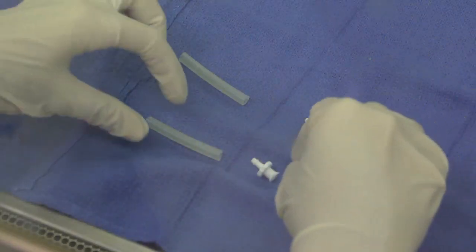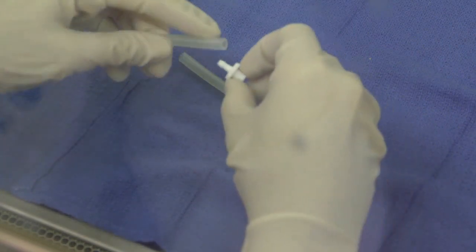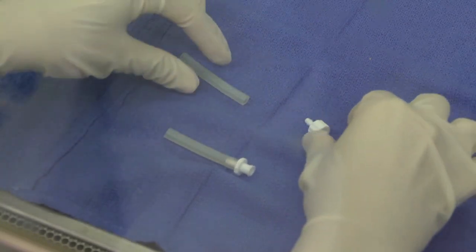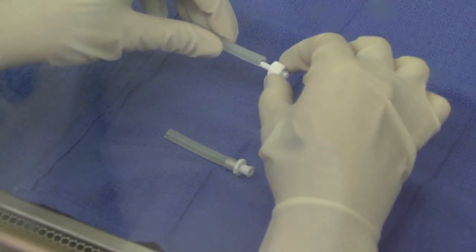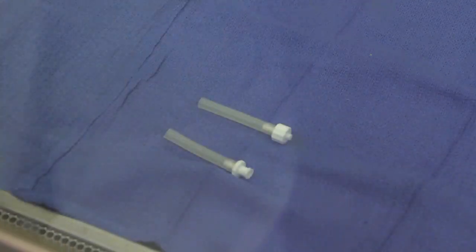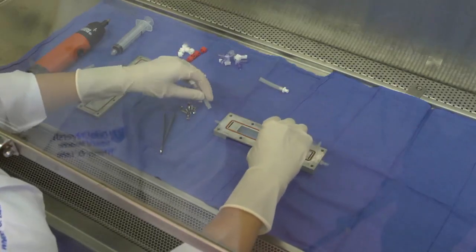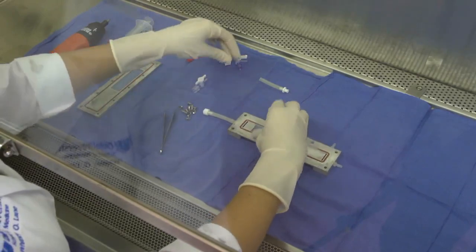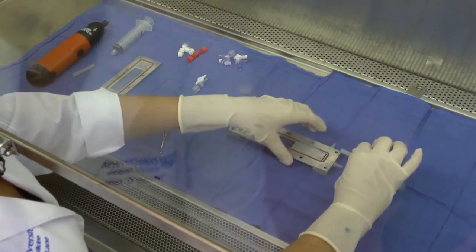For flow chamber assembly, use sterile gloves to connect one 2-inch soft tubing segment to a 1/8-inch female luer adapter. Connect another 2-inch soft tubing segment to a 1/8-inch male luer adapter. Attach the 2-inch soft tubing with female luer adapter to the inflow port and the 2-inch soft tubing with male luer adapter to the outflow port.